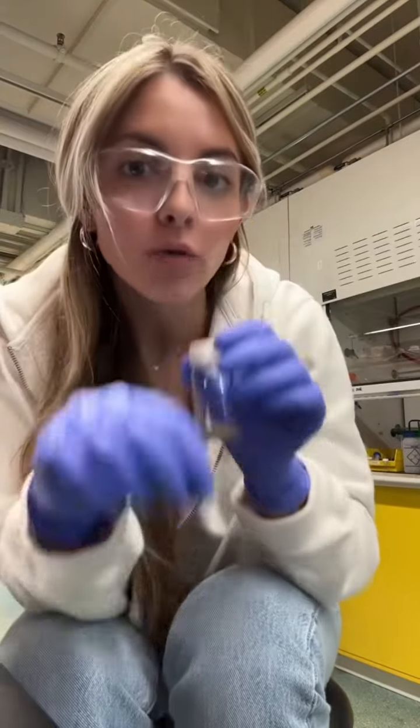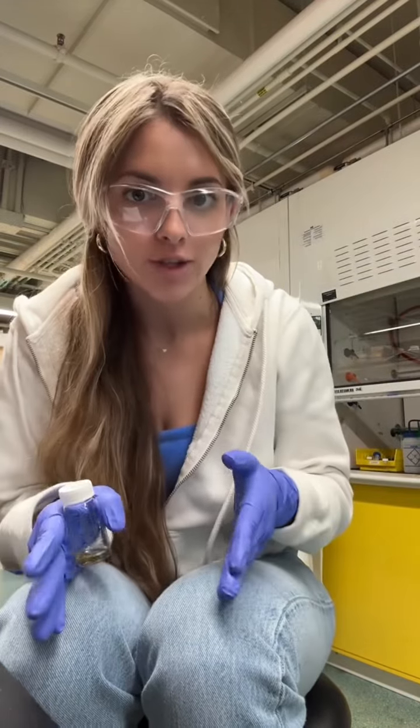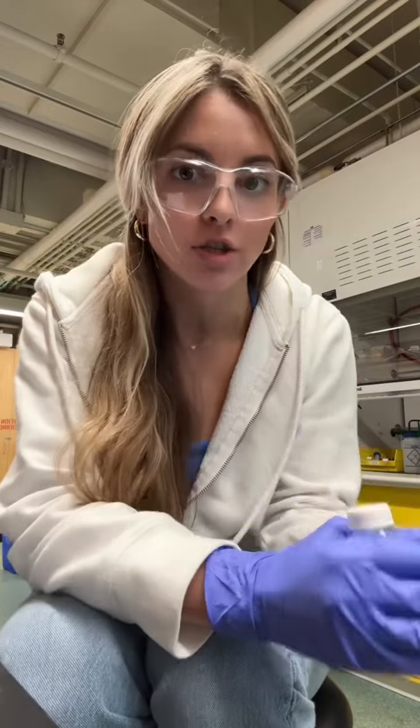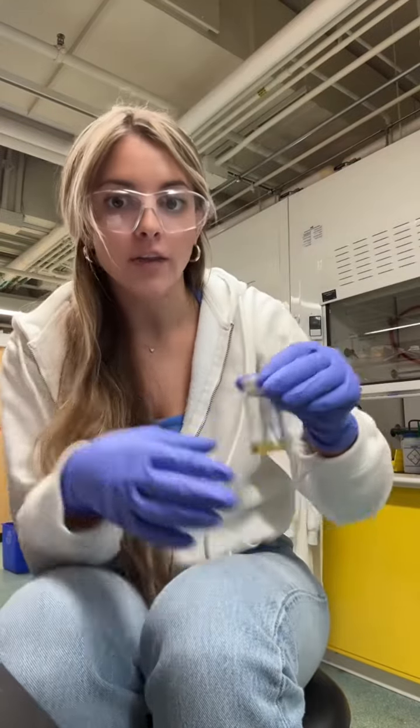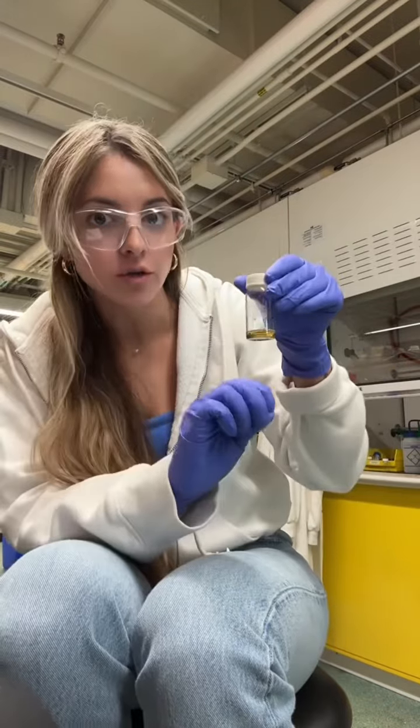So now, how I grow these crystals is initially I dissolve my chelator and the metal in a solvent that they're both soluble in, and this is usually at a pretty dilute concentration. You mix them together, and then hopefully nothing precipitates out of solution. You want everything in solution to begin with.